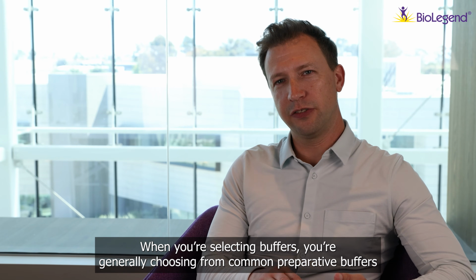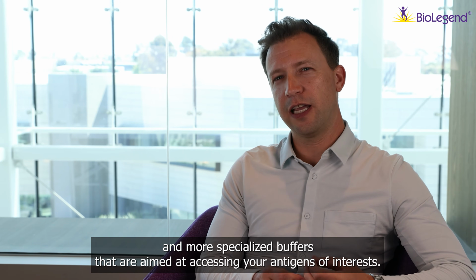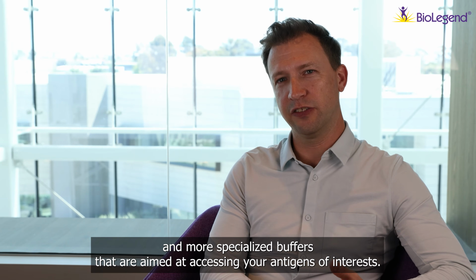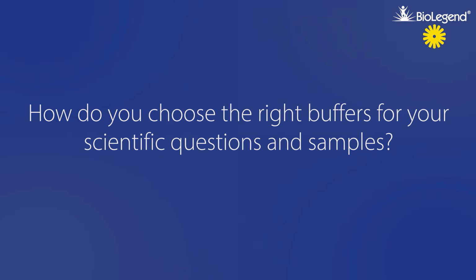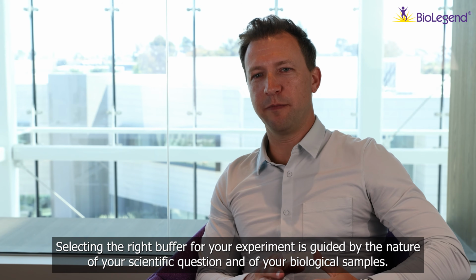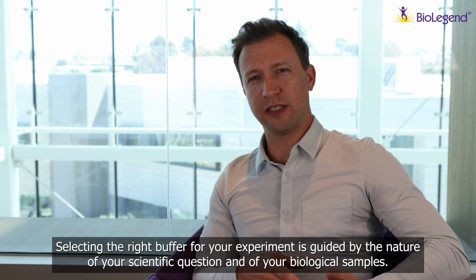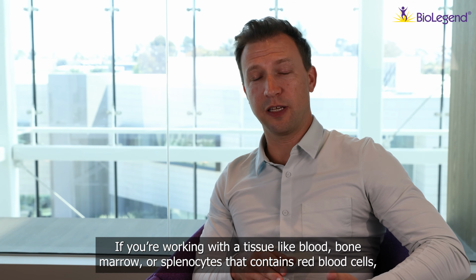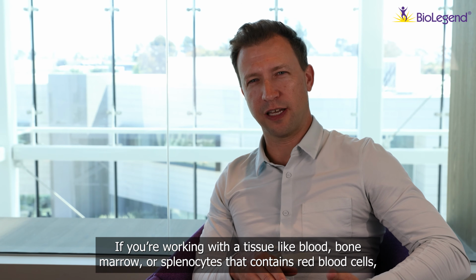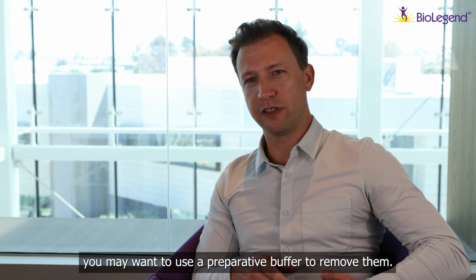approaches. When you're selecting buffers, you're generally choosing from common preparative buffers and more specialized buffers that are aimed for accessing your antigens of interest. Selecting the right buffer for your experiment is guided by the nature of your scientific question and of your biologic samples. If you're working with a tissue like blood, bone marrow, or splenocytes that contains red blood cells, you may want to use a preparative buffer to remove them.